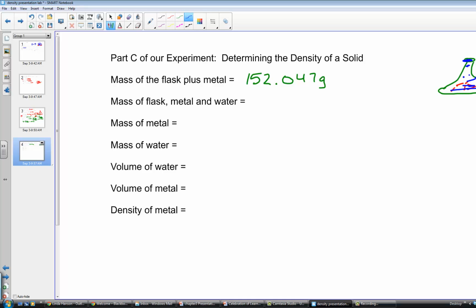So I have absolutely every spot occupied either by the metal or by water. Shake it up a little bit. Be sure that there's no pockets of air even after shaking it gently. And I want you to weigh it again. When the flask is completely full with metal and water, our pre-lab now says it is weighing 165.541 grams.